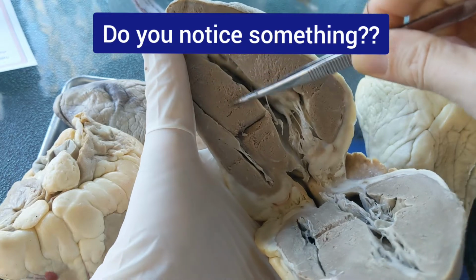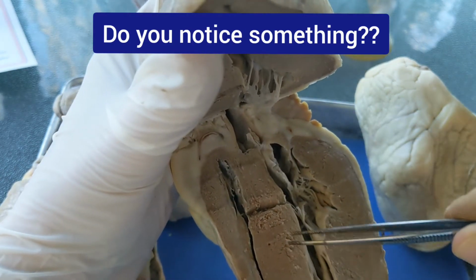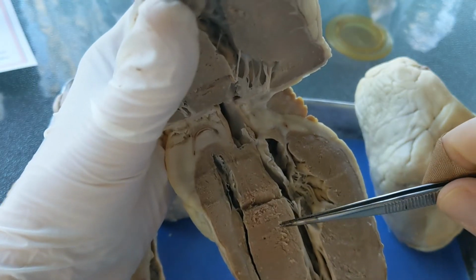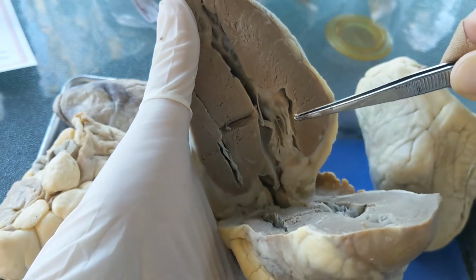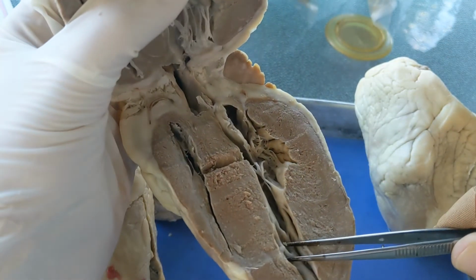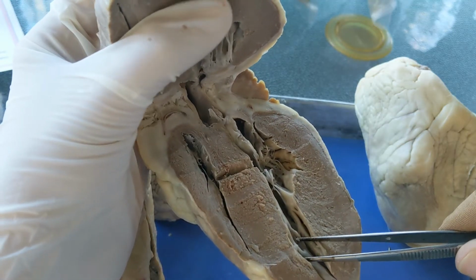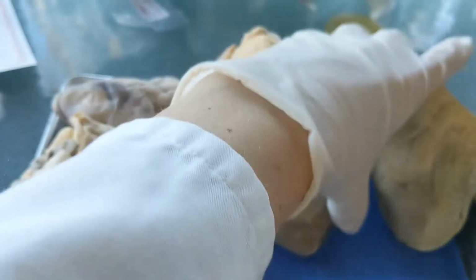Check out the septum. See if you notice any problems in the septum, and if you do, you need to note whether they're between the ventricles or between the atria, because there are septum abnormalities both between ventricles and between atria. Okay, so that is cardiac case C.